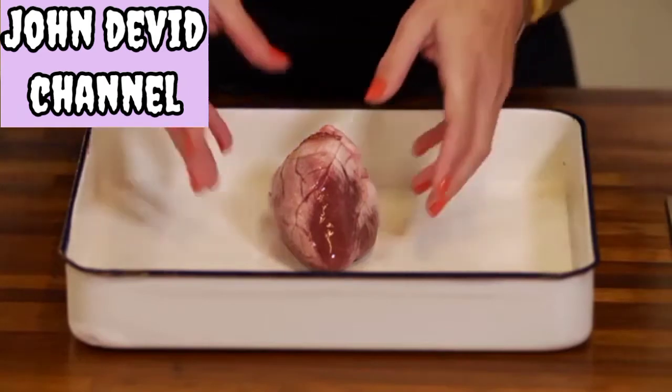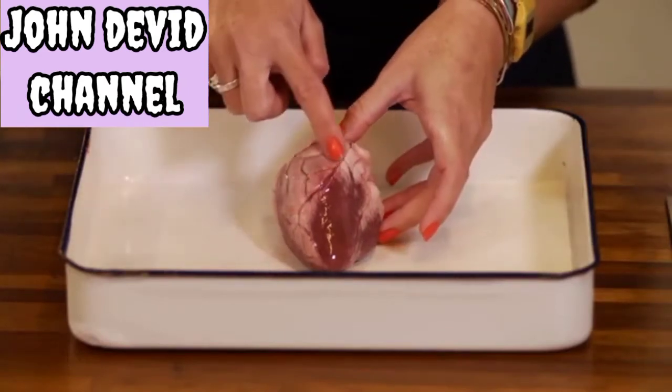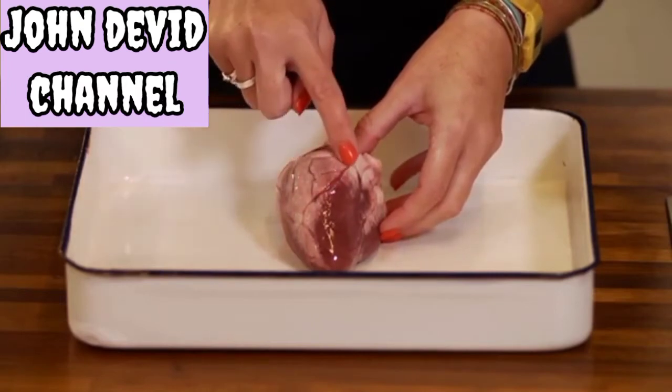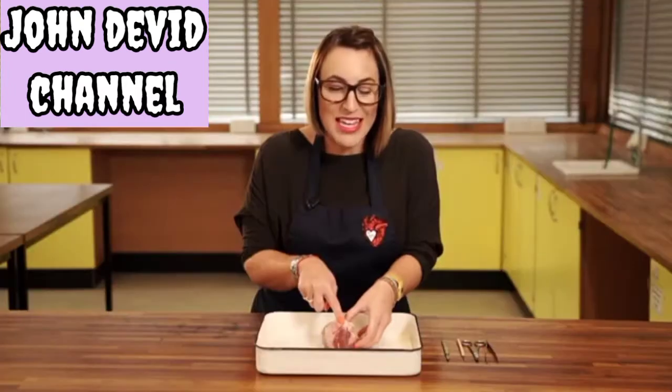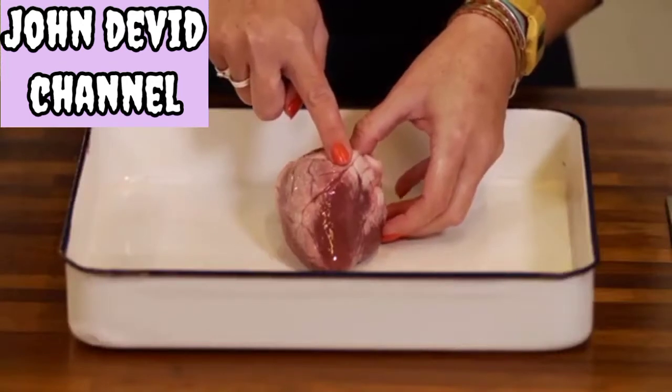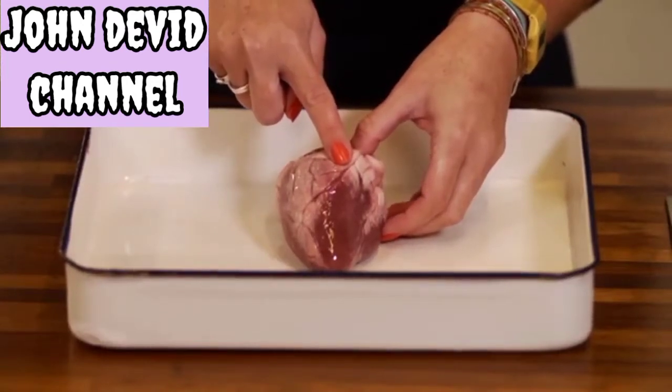When you receive your sample you'll be able to identify a number of structures on the surface. We have this crease or fold along the front of the heart structure. This is our interventricular sulcus and it's going to be a useful guide when you're cutting in, so you can separate the main components inside.